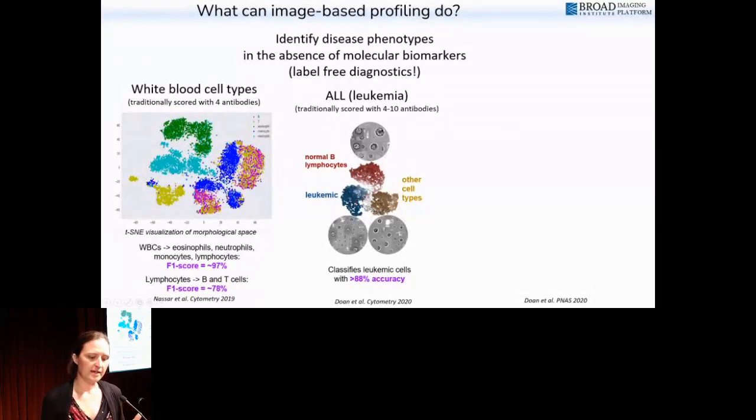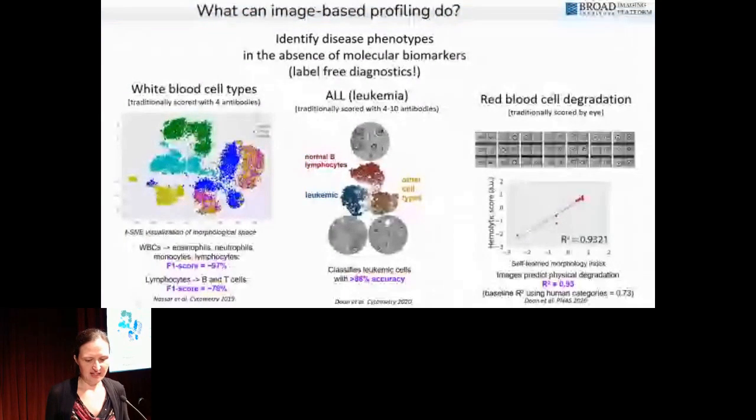So this really has gotten us excited about the potential. If you think about it, of course, this means there's great potential in bright field images alone, but it also makes you realize how much more information is even in the fluorescent images that we've been capturing. You don't want to just measure the amount of fluorescence. Of course, you would want to measure the spatial location of it, because that seems to be a really powerful source of information. The last experiment, I'll go a little bit more into detail.